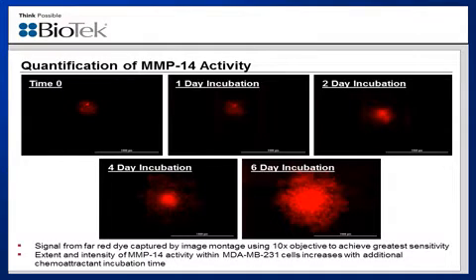The Cy5 imaging cube was used to properly excite and capture the emitted signal from the dye. As this is a red-shifted dye, and at times the signal from dyes in this wavelength range can be somewhat weaker than dyes in the blue or green range, we chose to perform the imaging using 10x magnification instead of 4x. This allowed us to capture the signal from the dye with greater sensitivity than would have otherwise been achieved.